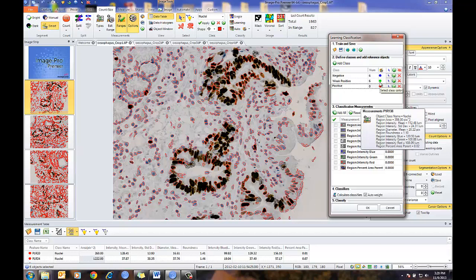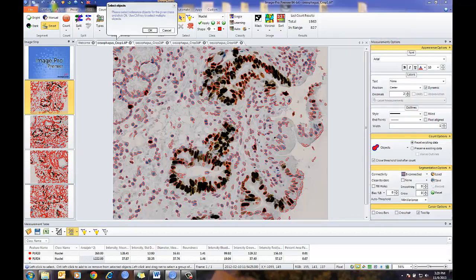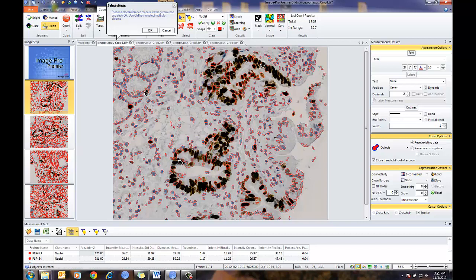I'm training the software and creating a training set, building up this classification scheme. I'm going to select the solid ones — selecting a couple of those. You can also see that for any nuclei I've already selected, it puts a little broken outline around them — essentially to warn you not to select that object again, showing previously selected objects. One thing you don't want to do is select an object and put it into two classes, as it will lead to inaccurate results. I'll press OK.